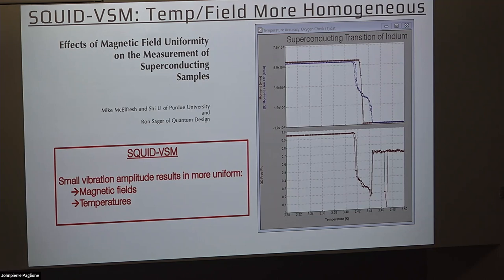Unless you think you've put the thing next to something that's emitting something. We've had to do this with customers and then retune it, but then you keep it there. You don't have the ability to tune the frequency. Do you know roughly what that frequency is? It's on the order of 10 to 20 hertz. So it's a relatively slow jiggle.